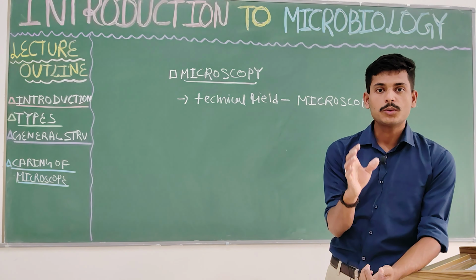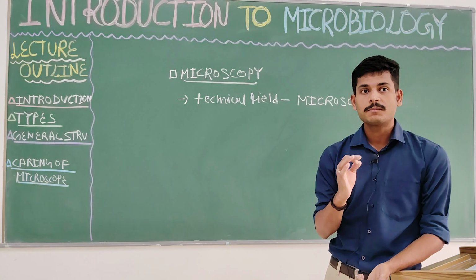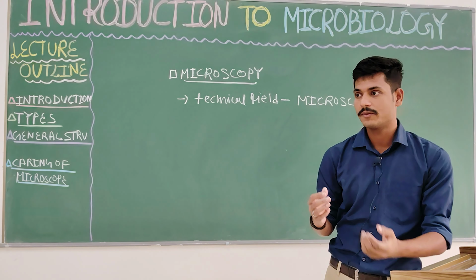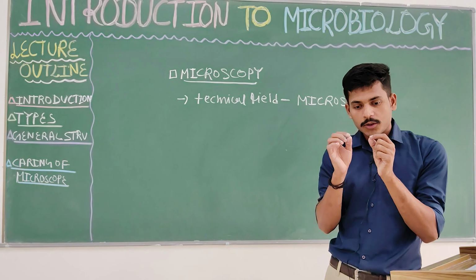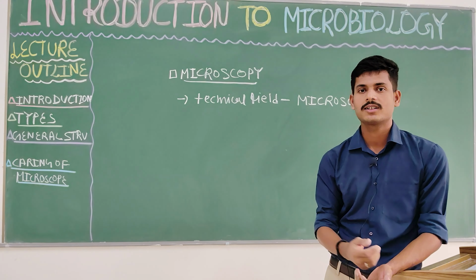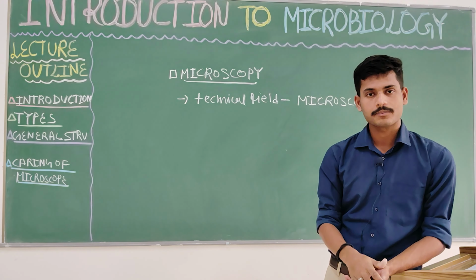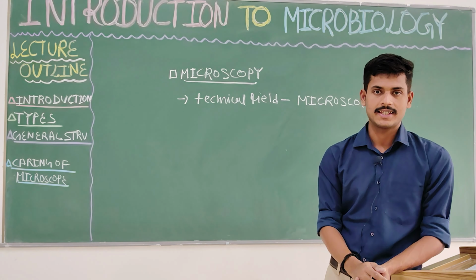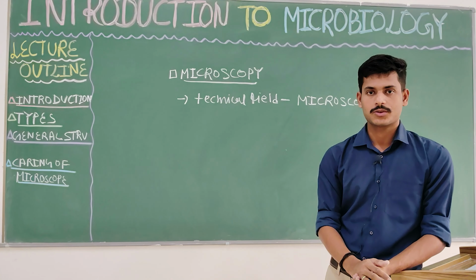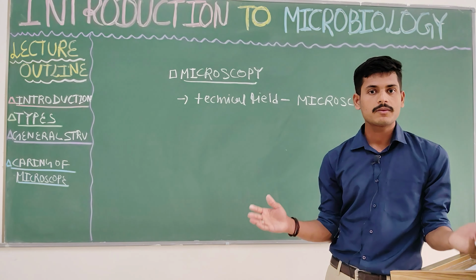Sometimes we have to understand microbes in a superficial way, and sometimes, if we are doing research and want to understand the minute fine details of a bacterial cell or a eukaryotic cell, the inside environment of a living cell, we have to use the advanced microscope. So there are different types of microscope.